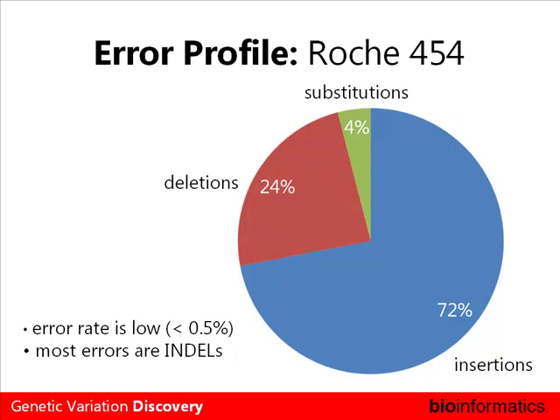Ultimately, if you have the resources, what you really should do is take a synthesized oligo or a known control or something, and then do thorough testing to see what the error rate is. But if you're just playing quick and dirty, this is the way that a lot of people do it. In the end, these kinds of statistics don't really differ that much. The actual proportions might shift a couple of percent here and there. But when you just evaluate a normal data set, it's pretty solid.